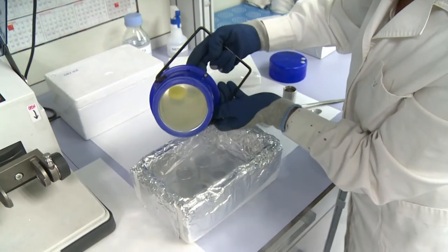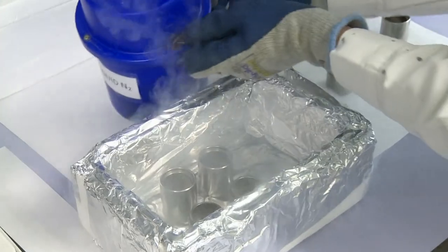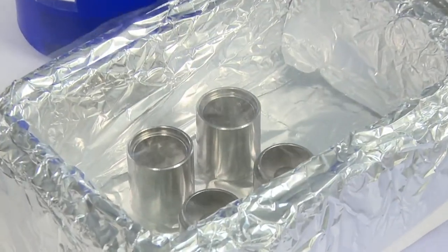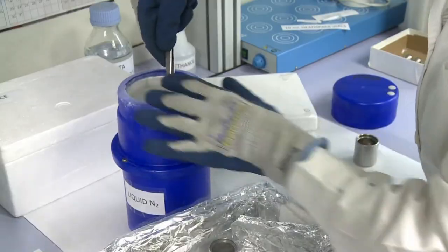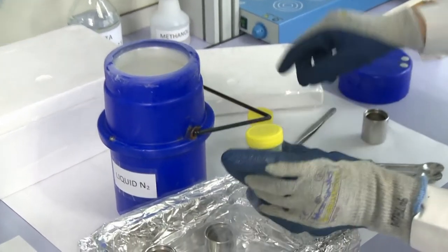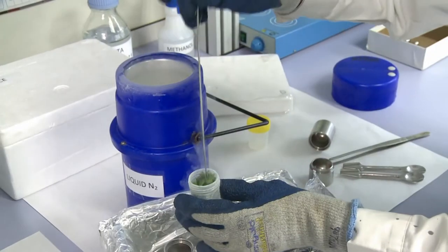To homogenize the samples with the tissulizer, you have to pre-cool with liquid nitrogen the capsule and the bowl needed. Proceed as in the case of fruit, bearing in mind that you will get the powder more easily than in the case of fruit.